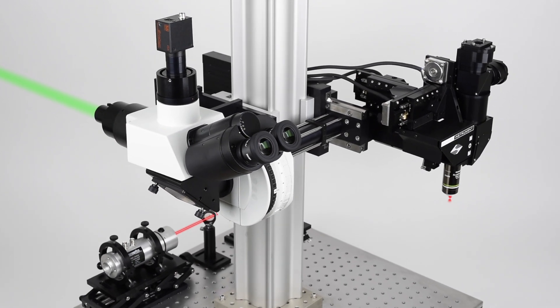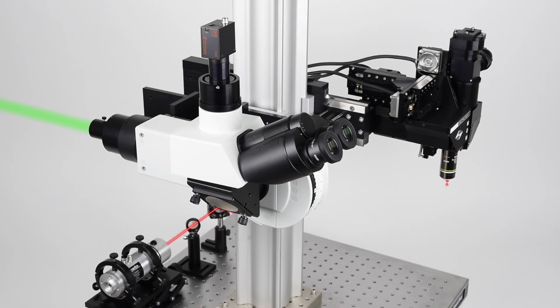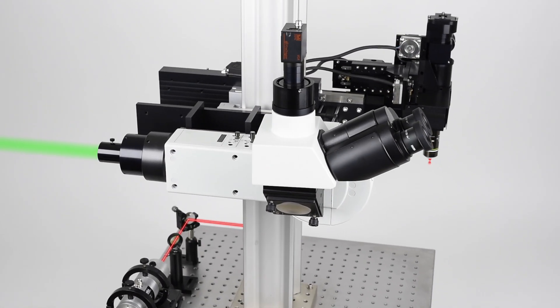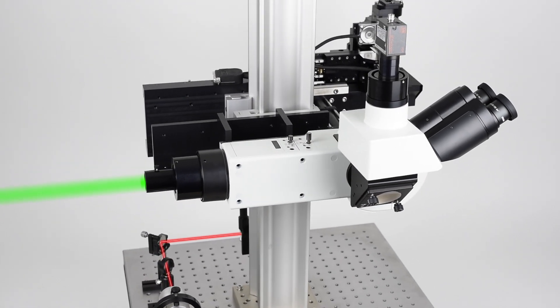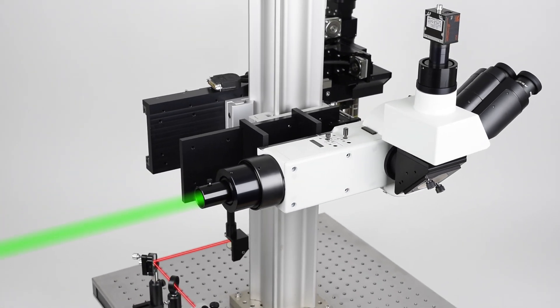Excitation light is brought in through the rear port of the vertical illuminator and then reflected to the sample through the use of excitation filters and dichroic mirrors, allowing full utilization of wide-field imaging modalities.